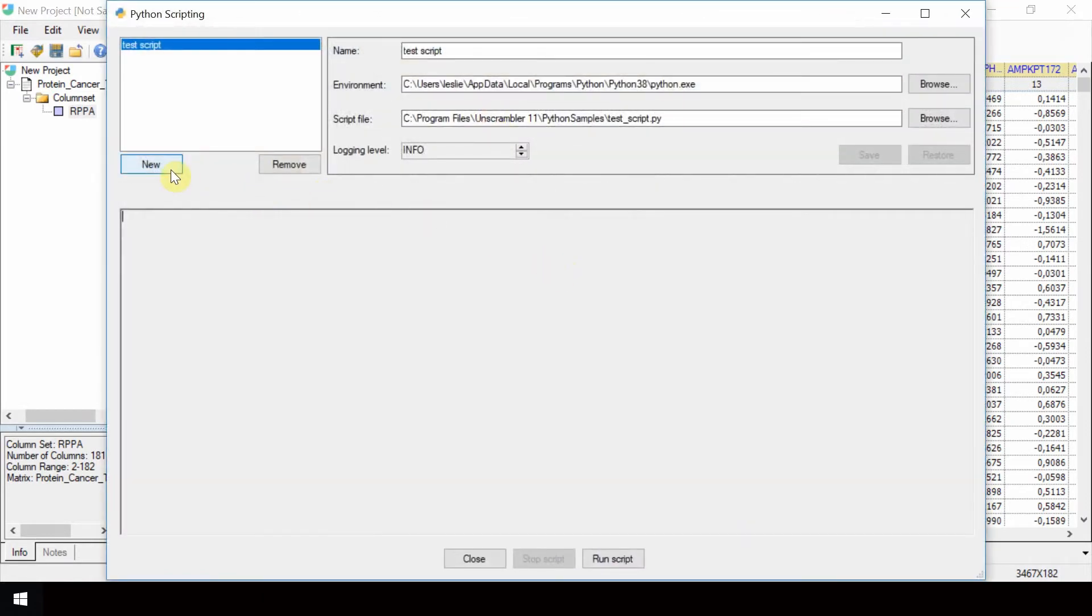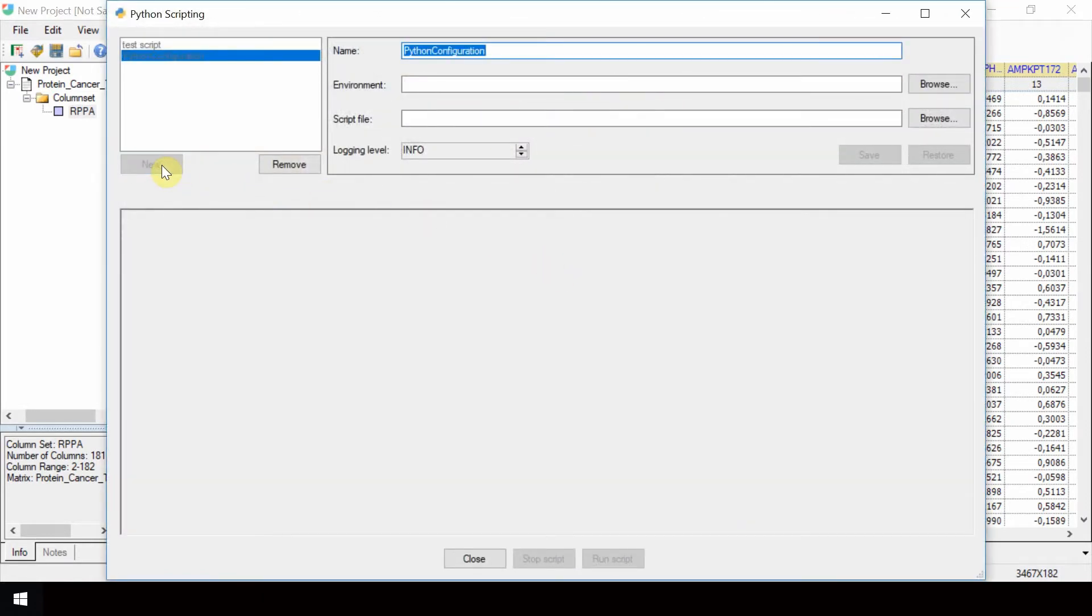Click on New to set up a new configuration. The default name, Python Configuration, will appear for the new configuration. Change it to TISNY.